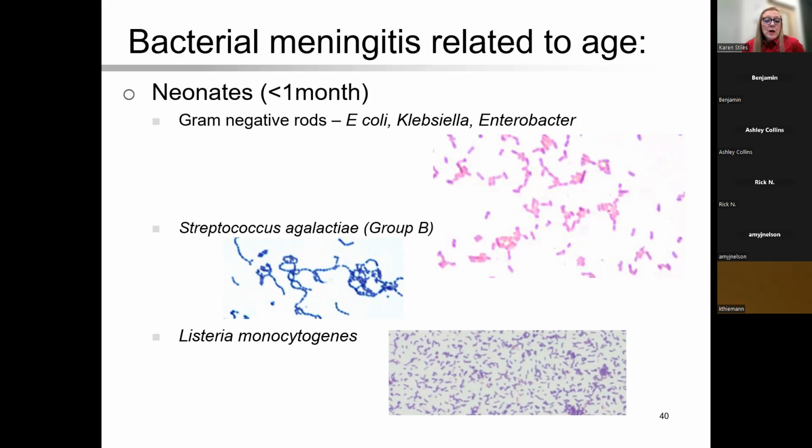If you do have CAP or PULA or API PT slides, once you get the answer, you can relabel the slide and put that in your reference box and have that right there by your microscope, so that if somebody wants to compare a listeria to a gram-positive rod, and you think that would be easy to differentiate, but to many people, if they're looking only at listeria or only at a gram-positive rod like bacillus, sometimes it can be hard to tell the difference.